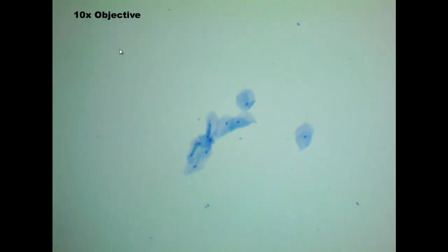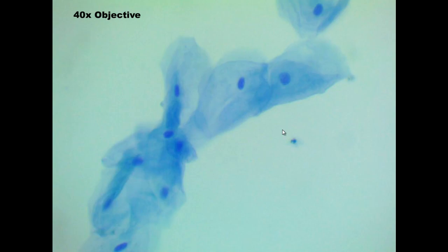Now you're going to have to get some of these into the center of your viewing field and use the 10x objective. At this objective we can see these cells pretty clearly but we're going to go a little higher to the 40x objective and now we can see our nucleus and our individual irregularly shaped squamous epithelial cells.